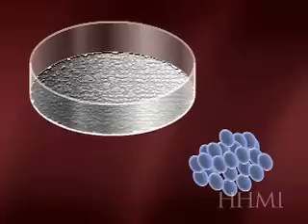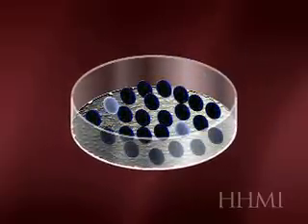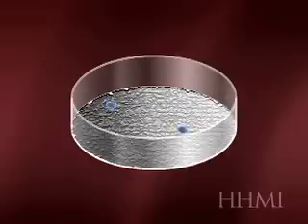Usually there are mouse embryonic fibroblasts on the bottom of it to help the cells grow. Most of them don't survive but a few do and can grow into colonies of cells as you'll see here.